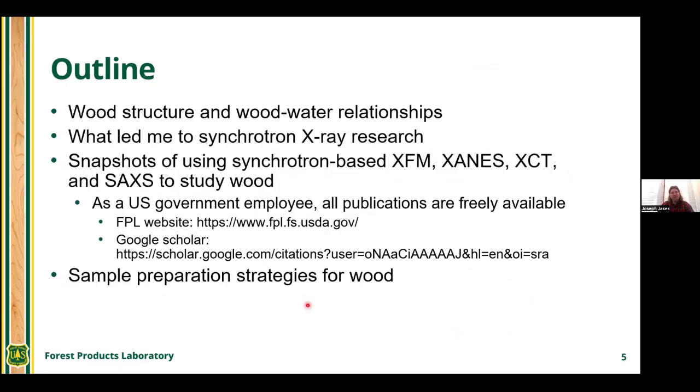So in the outline of my talk today, I'm going to briefly go over the multi-scale wood structure and also wood-water relationships. I'll talk briefly about what led me to synchrotron X-ray research and how I got there. And then I'm going to provide a few snapshots of how we use synchrotron-based techniques, including X-ray fluorescence microscopy, X-ray absorption near-edge spectroscopy, X-ray computed tomography, and SAXS, small-angle X-ray scattering, to study wood.